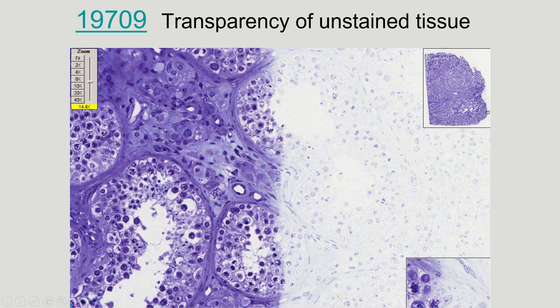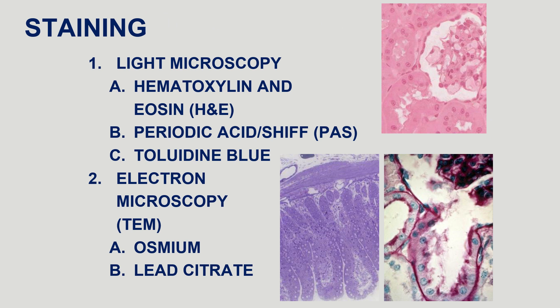Once we fix the tissue and slice it into a very thin piece, we have to stain it. As you can see, this is a tissue that wasn't stained properly — if it's not stained it's transparent and we can't visualize anything. We do have to stain it to see what's going on. We're going to go over the different stains of light microscopy in this video, starting with the most common one: the H&E stain.